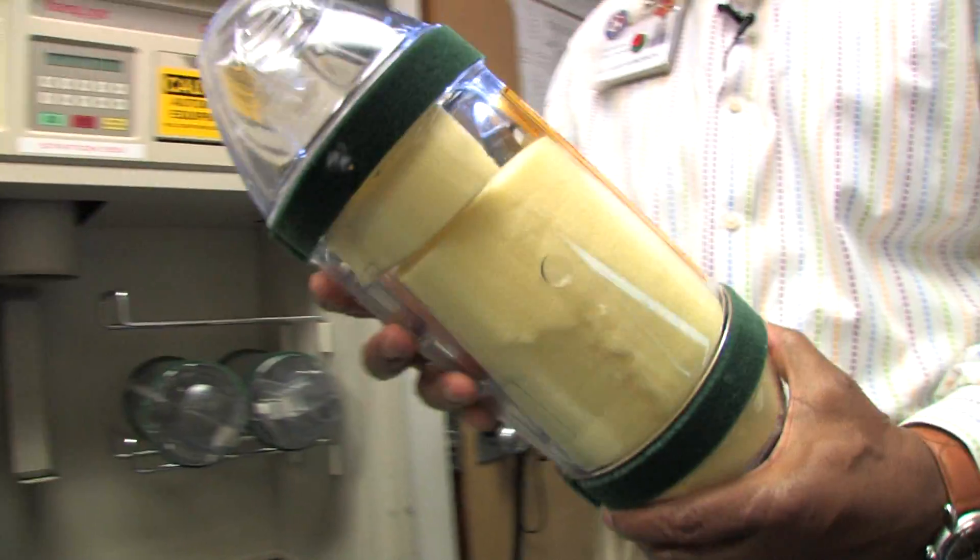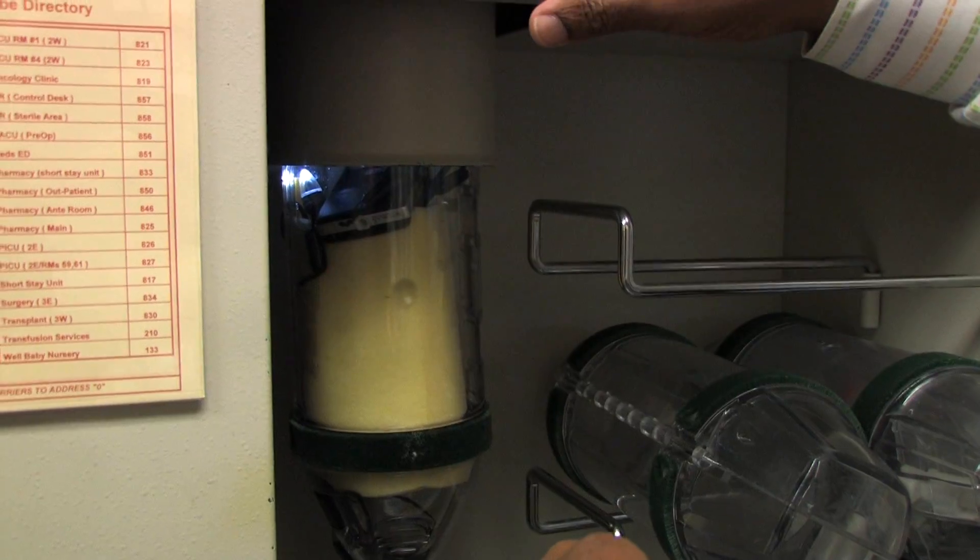Okay, here we go. What we're doing is sending it back to ourselves.